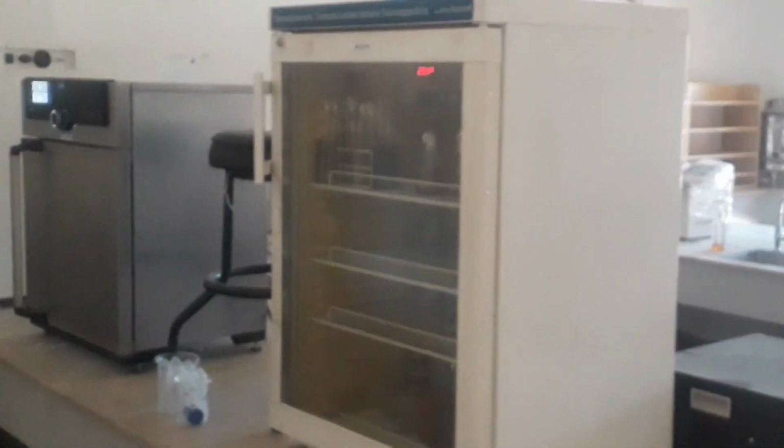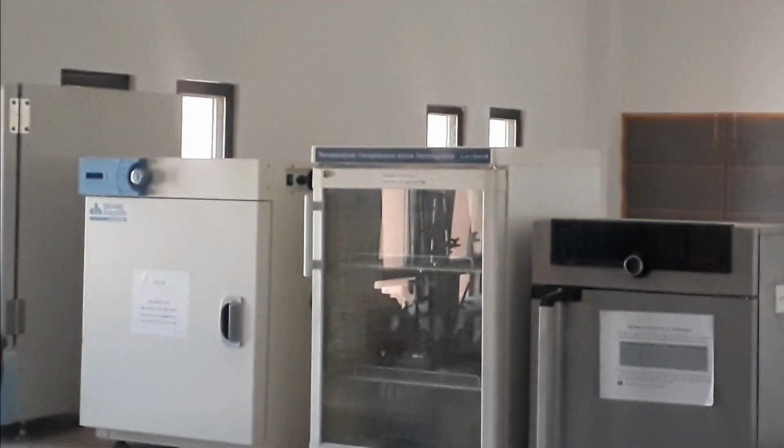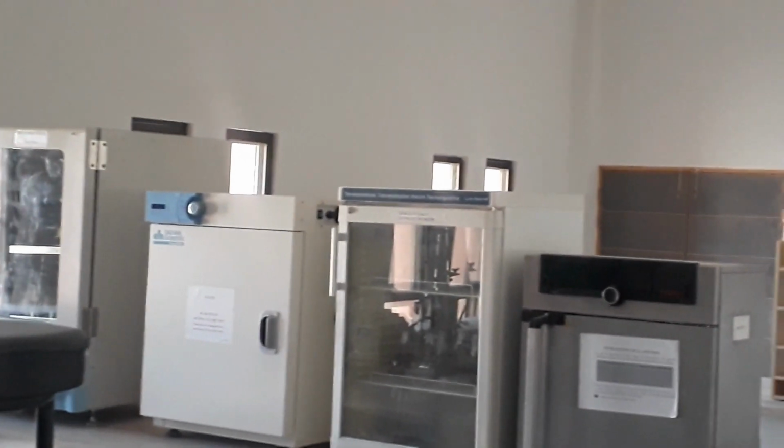With their precise control and monitoring capabilities, incubators are indispensable tools in modern laboratories. In conclusion, incubators are vital equipment that enable scientists to create optimal conditions for their experiments and achieve accurate results.